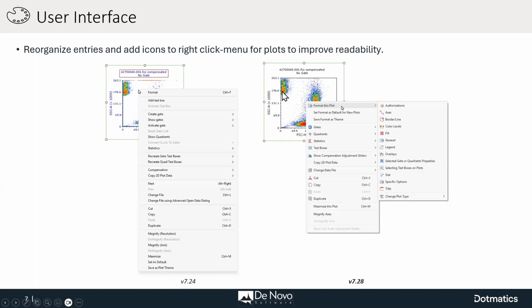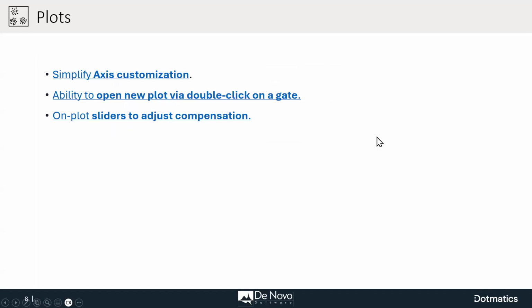So why do I use screenshots to show you this? Because the next part of my presentation will use FCS Express in real time, as we usually do during webinars. So you will see all of this. You will see the dark mode, you will see the new ribbon bar, you will see the right-click menu, and so on. And also the startup script, of course. So next chapter. How about plots?